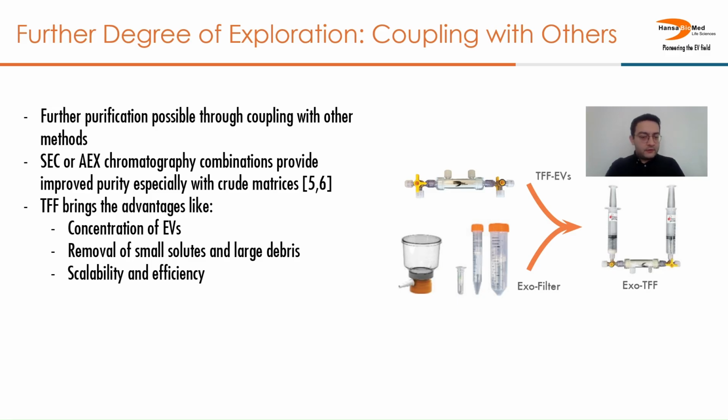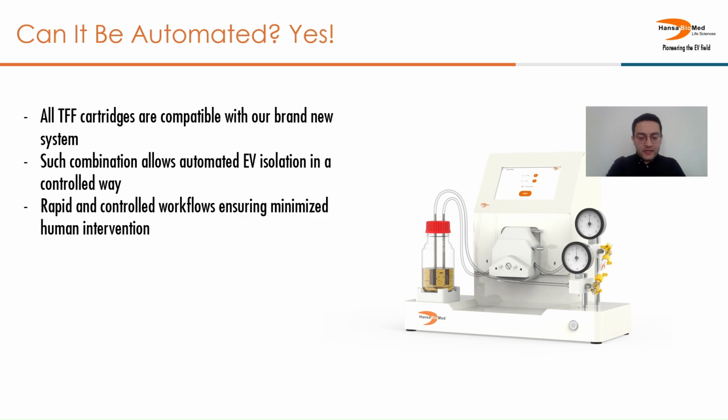And even further, apart from the technical aspects of it, let's say regarding the versatility, the purity, the yield, up until now I mentioned always that it can be used manually, but especially if you want to process large volumes, not a couple of hundreds of milliliters, but liters or even tens of liters, of course, it might not be so suitable to just connect two syringes on both ends, but you might require some automation.